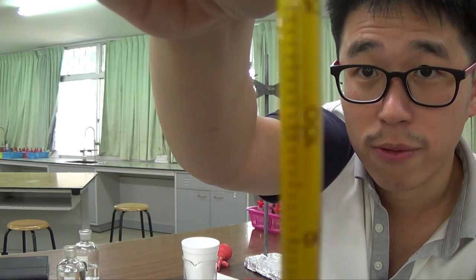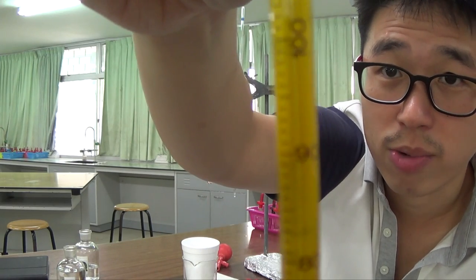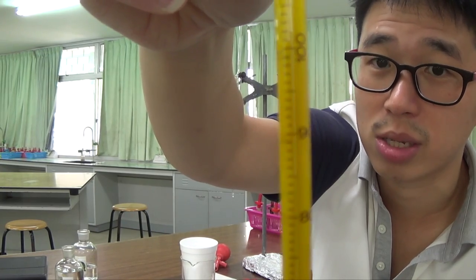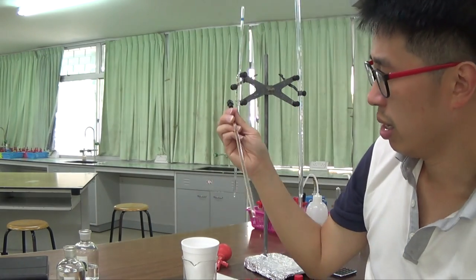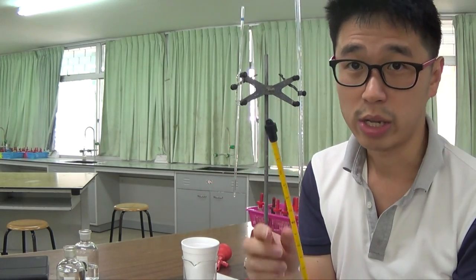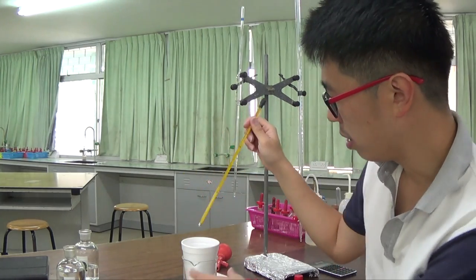If you see carefully, every one small line represents 1 degree Celsius. So the thermometer can actually be read to 0.5 degrees Celsius, as you know the accuracy of a thermometer, if you are doing A levels, okay? Not a big deal if you are doing IGCSE.